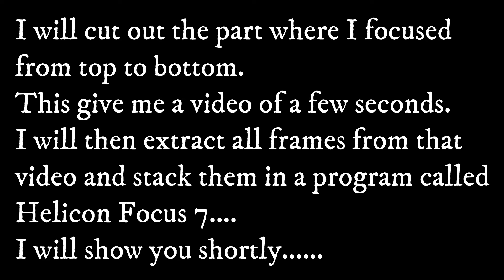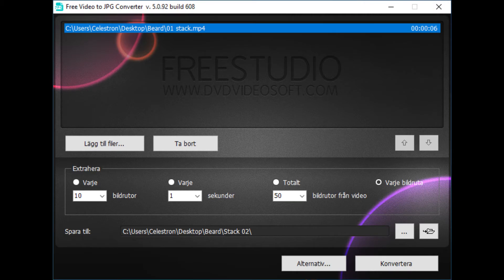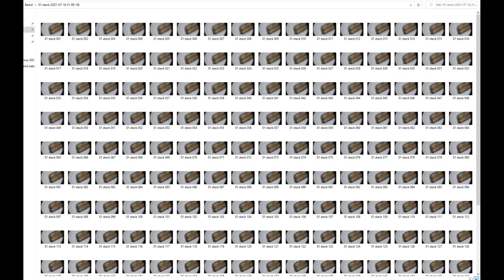So I will cut out the part where I focus from top to bottom. And this will give me a video of a few seconds. I will then extract all the frames from that video and stack them in a program called Helicon Focus 7. I will show you shortly here. This is the piece of video that we get when cut out, about 4 seconds. I will then use this program called Free Video to JPEG Converter. I choose to extract every frame so I get a lot of frames like this.